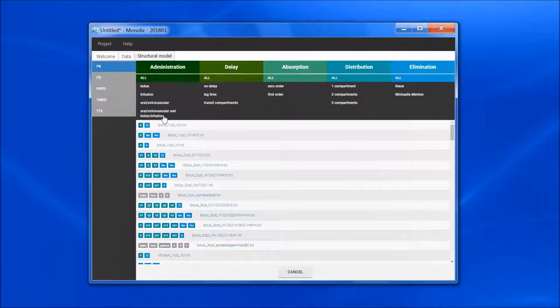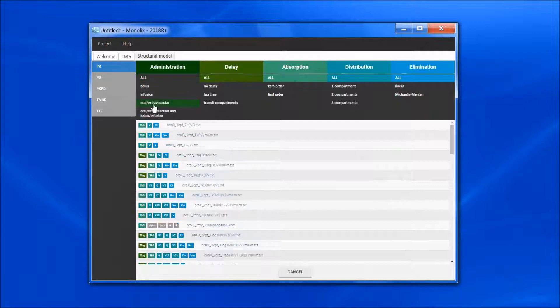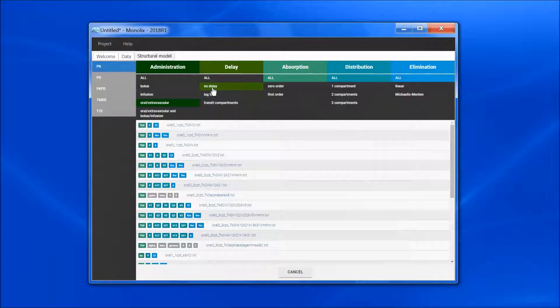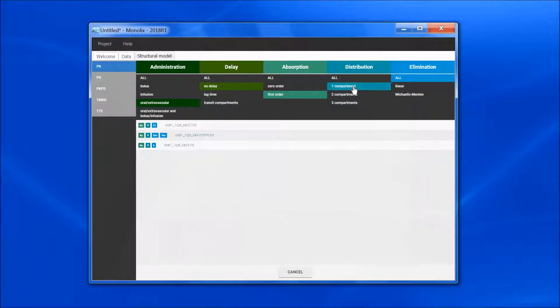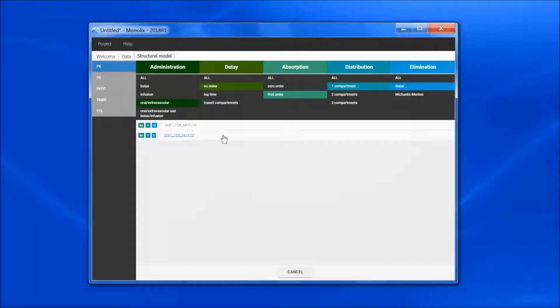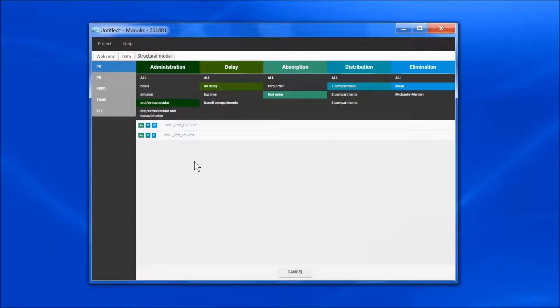I will, for instance, select Oral Extravascular for the administration, no delay, first order for the absorption, one compartment for the distribution, and linear for the elimination. I end up with two models only, which correspond to different parametrization with either macro or micro constants.